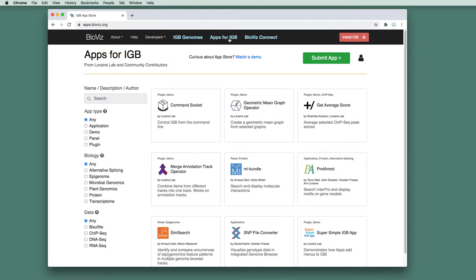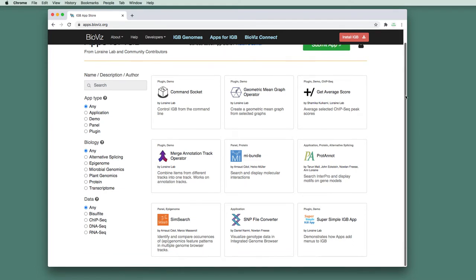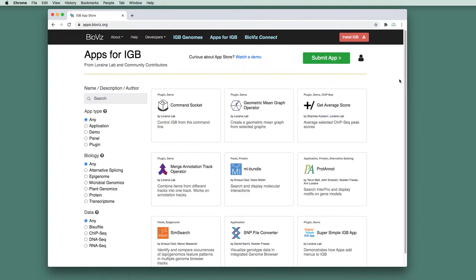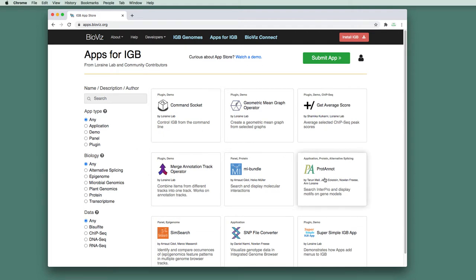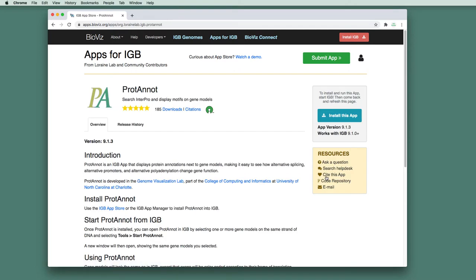And from here, you can search for and learn about the different apps that are available to install in Integrated Genome Browser. To install an app, you can come here to this page. Once you've found an app that you're interested in, just click on the tile for the app.